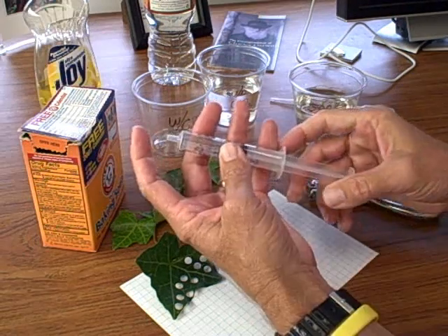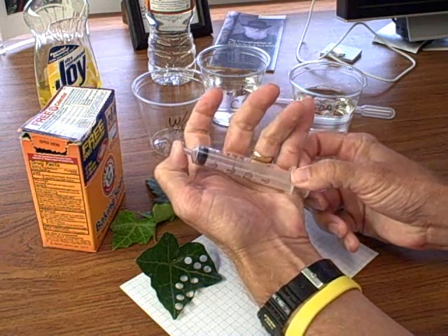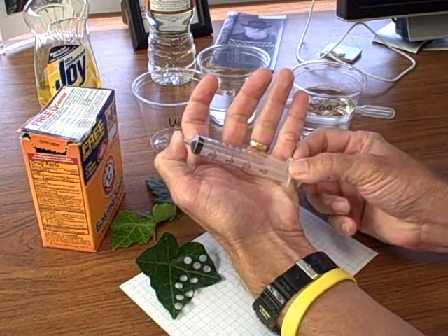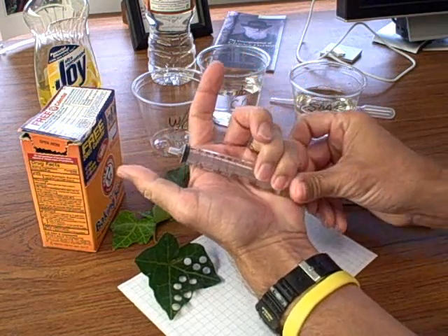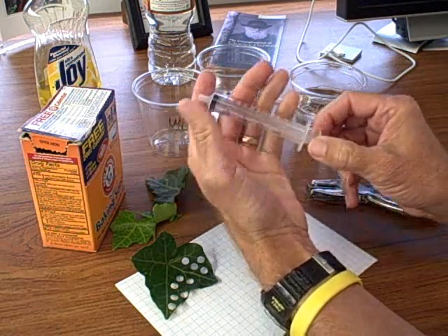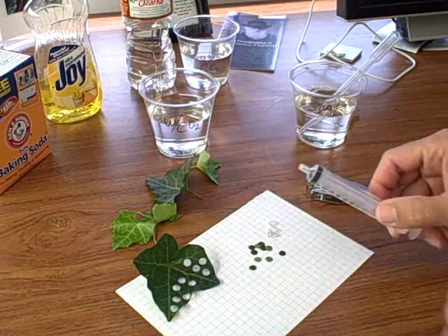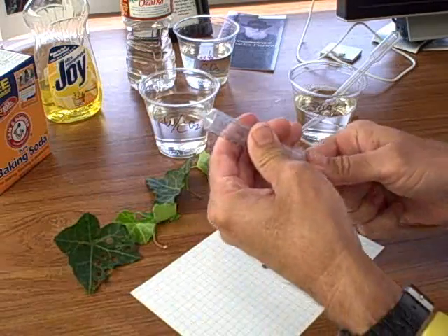You need a syringe that has a good seal. Notice that when I pull out the plunger with the end sealed, the plunger comes back — that means we have a good vacuum. So I'm going to add the leaf discs that I've cut out.